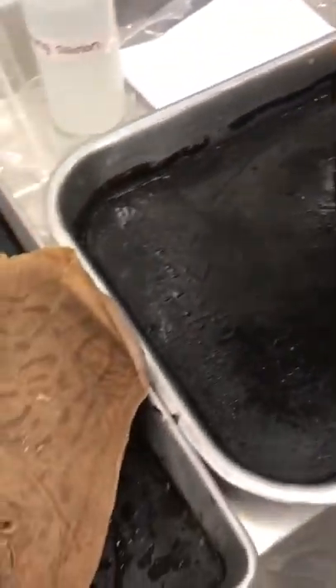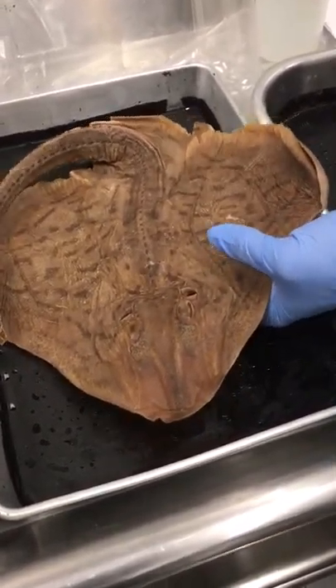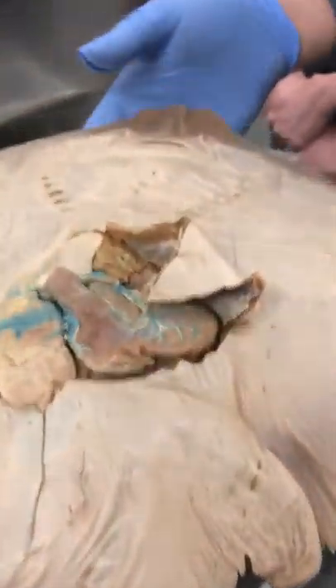It's the same story with these guys — spiracles right here. This would be a stingray. Same thing here: gills here, spiracles on top, and water goes through.